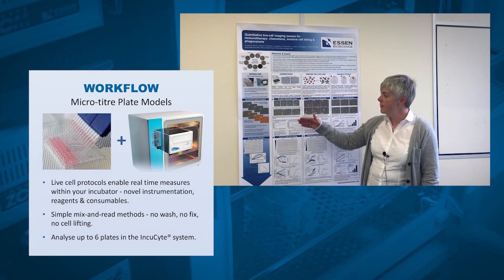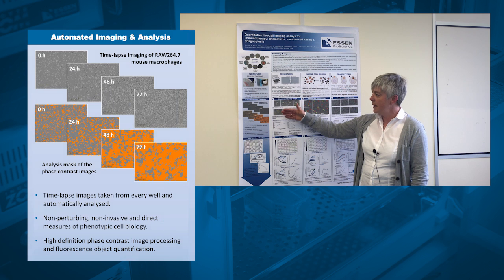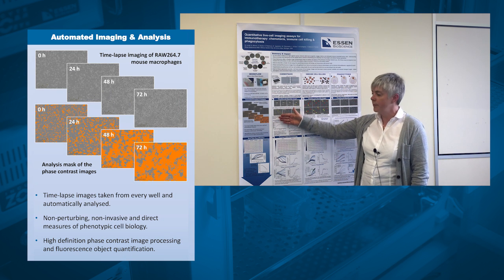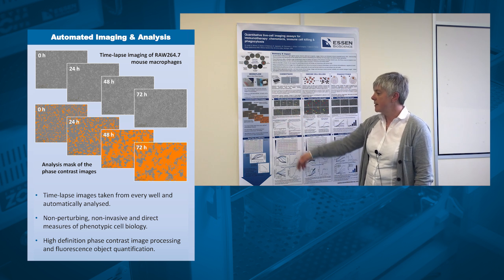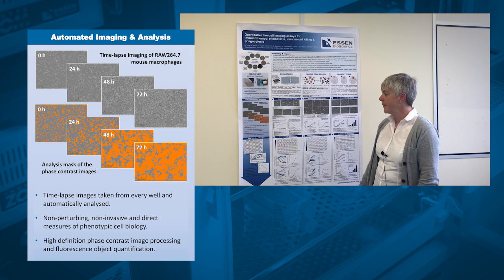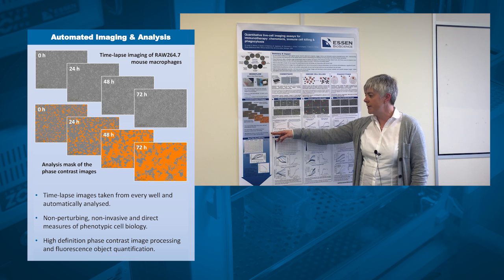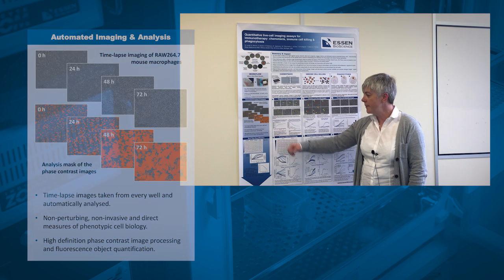The instrument itself provides you with an automated image analysis and image capture system, and what we're looking at here is time-lapse images taken from every single well and then inline automated analysis of those images. So all of the assays are non-perturbing, non-invasive and are direct measurements of the phenotypic cell biology that we're interested in. The machine has the capability of collecting high-definition phase contrast images, but also fluorescent object process analysis.